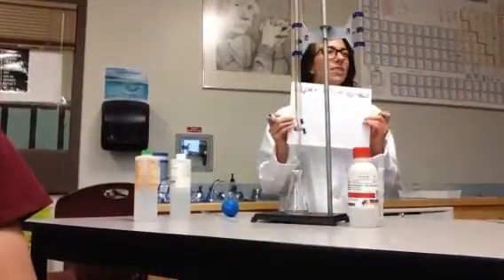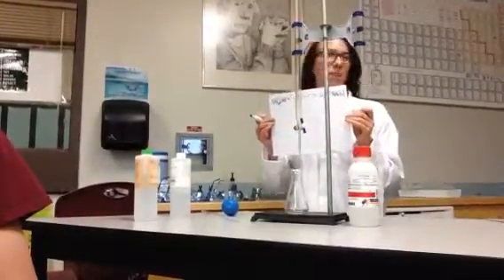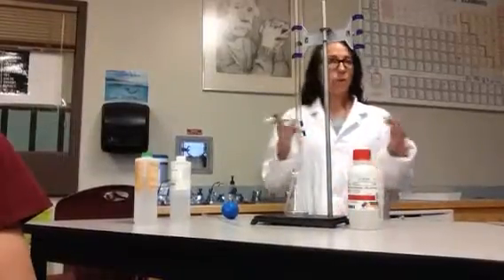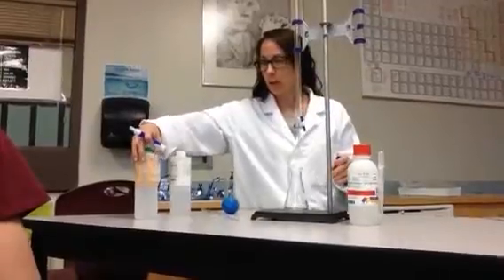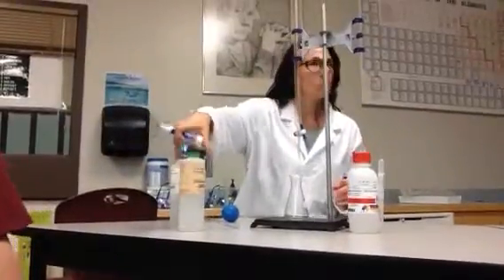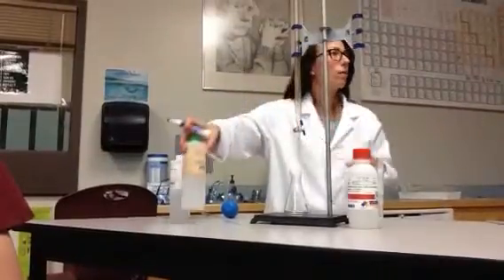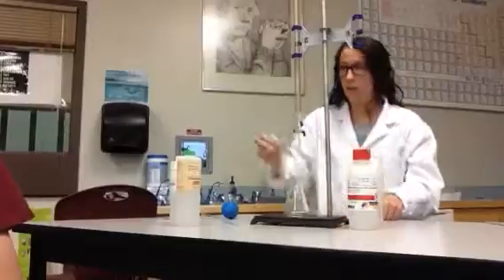What kind of reaction is it? According to your solutions test, some of you just learned a neutralization. Okay, good. So true to the solution titration that we've been doing. This I bought from the shops, ammonium hydroxide. It says on the bottle that it is exactly a 1 mole per liter solution. So I know the concentration of this.